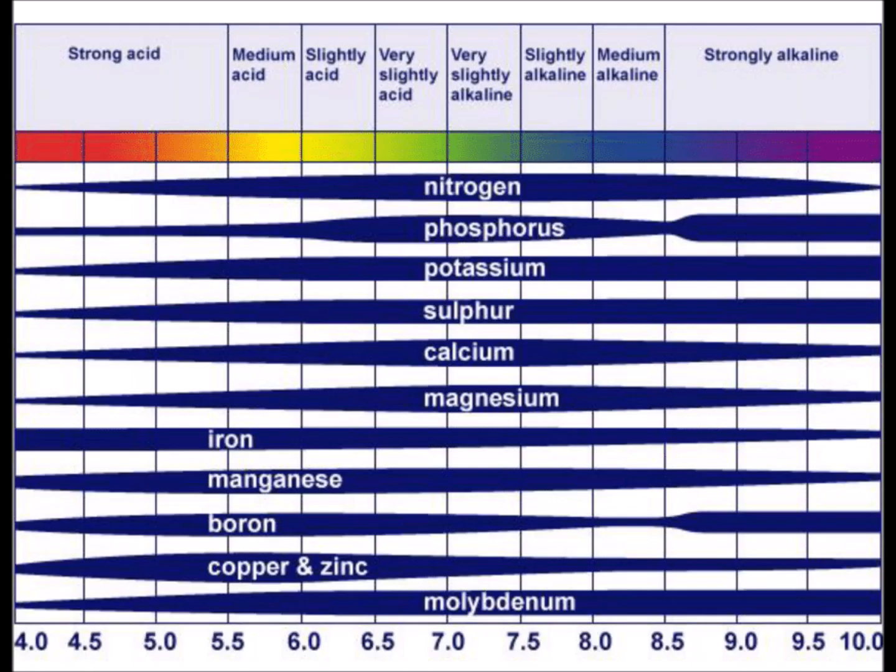This chart is giving you a clear idea of how important pH is. So if you see, in a hydroponic growing system, 6 to 6.5 is the good pH value. And the one probe we calibrated was showing 5.1 instead of 6.8. So that's a kind of problem, you can just visualize. If it is showing you a lesser reading, it is impacting nutrient availability. Despite all the nutrients being available in your solution, they will not be available for your crop.